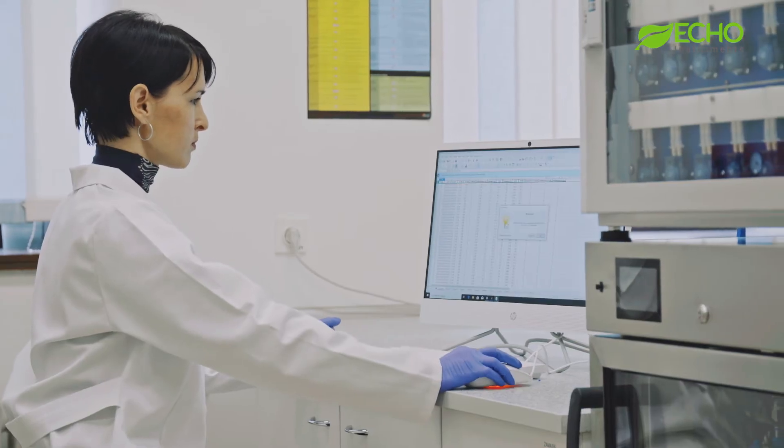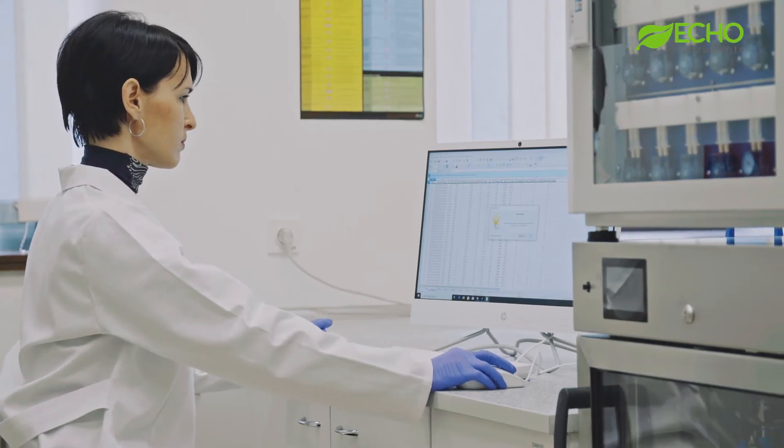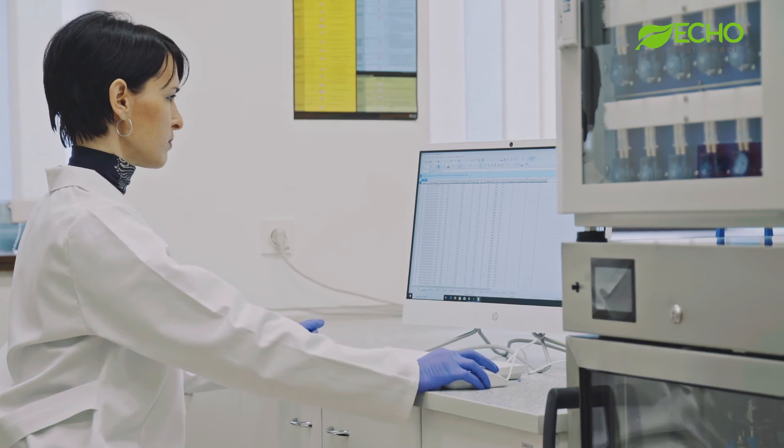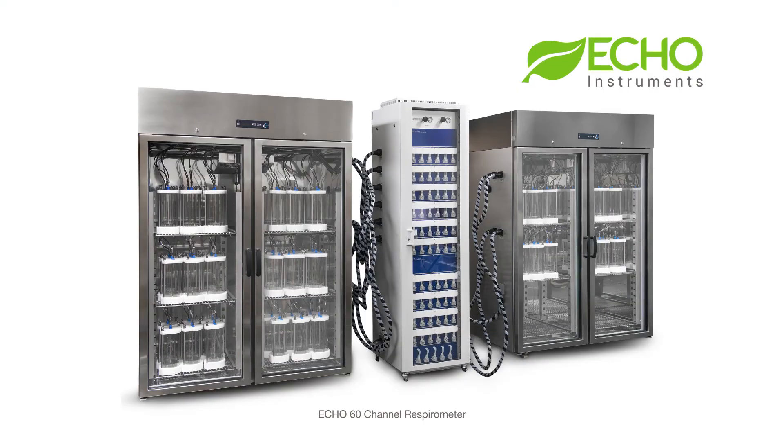The ECHO Instruments team provides installations and professional assistance to all customers. Save time and measure multiple samples using multi-channel ECHO Instruments respirometers from 6 to up to 60 channels.